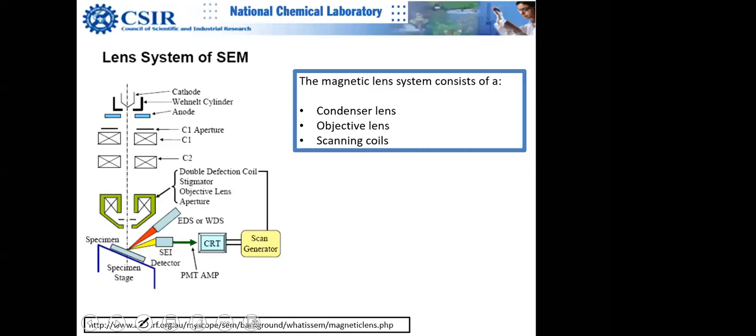Then you have this lens system, the condenser lenses C1, C2, and then you have this deflection coil, because you have to deflect the beam. You have to scan the beam, raster scan it. Remember, it is SEM. Then this is your specimen, your cockroach or sandwich or whatever, or bhakri. You can put anything actually. I'm not kidding. Even in this NCL101, you can put a piece of bread there and look at it, or a butterfly wing, or a peacock feather.